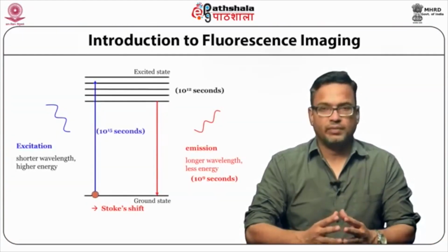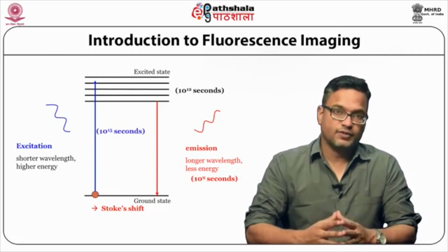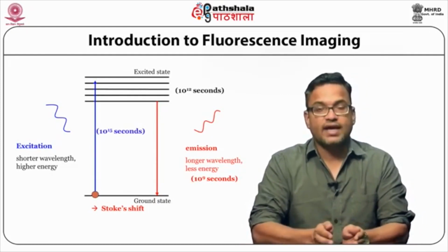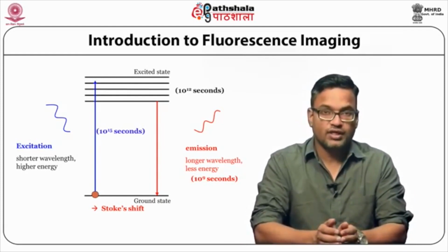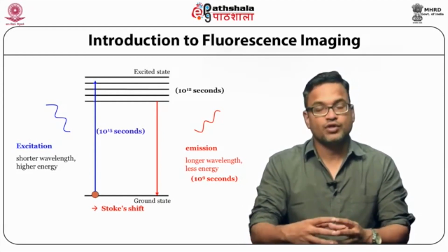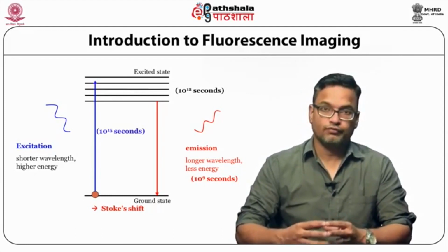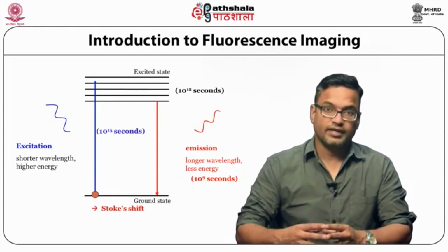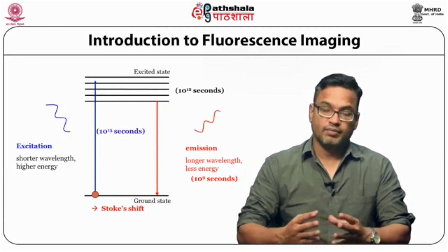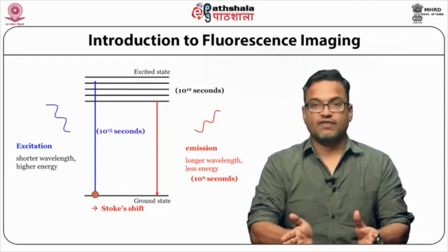Wide field microscopy or epifluorescent microscopy, or in general it's called fluorescent microscopy. And as the name suggests, wide field microscopy, in this the entire sample, the wide area, is illuminated. And as I mentioned in earlier slides also, the core principle behind fluorescent microscopy is that you have a fluorescent molecule that is tagged with your sample. Now we need to excite that particular molecule to visualize it under a camera or through our eyes. So we need to provide it a wavelength through which it can be excited. Depending upon the fluorophore that we are using, we know what exact wavelength we want.